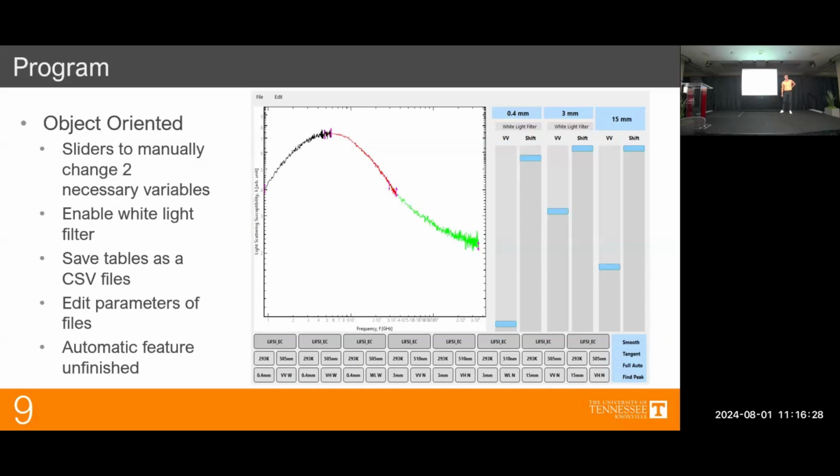Sorry, when you expand into Raman, would you expect it to basically lose stability as it goes further to the right? It does lose stability. I don't understand the theory behind that, but typically it kind of looks opposite of the green, and then it just kind of does this big old jump thing. I don't understand why, but yes, it does lose a lot of its consistent curve.